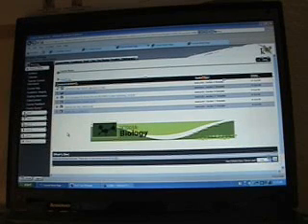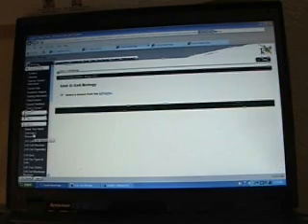Here we go. This is going to be information for Lab 3.10. And first thing you want to do is go over to Unit 3, to your lesson, your unit resources, and the advanced prep. And you're going to get a window that pops open that is going to give you your advanced prep information. It's going to explain a little bit about what you're going to go ahead and do, preparing the phenolphthalein agar mix.